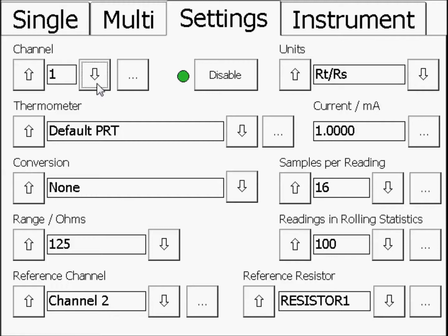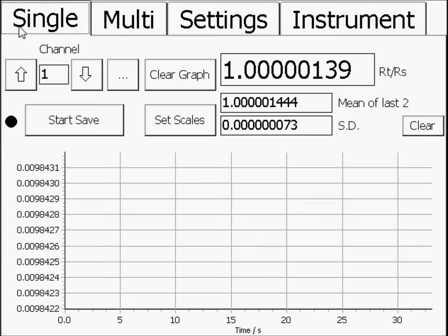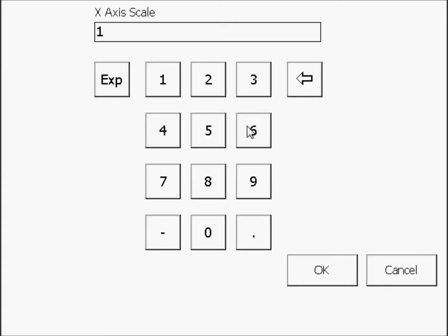Now, press the Single tab to see the measurements in numeric and graphical form. Press the Set Scales button to open the Graph Scales window, and ensure that Auto Scaling is switched on. Use the Radio and Ellipses buttons to set the X axis to 60 minutes.